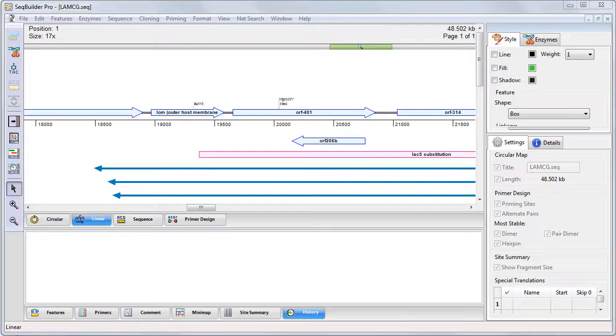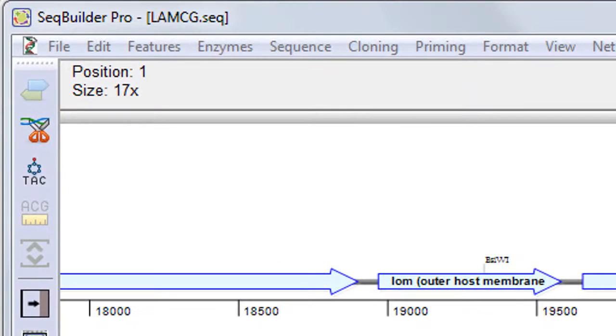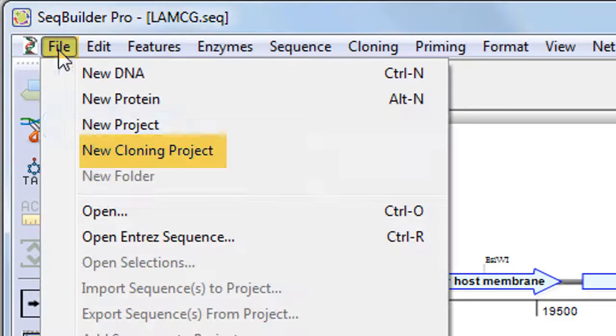To create a virtual clone, start by launching SeqBuilder Pro. Then create a new cloning project using the File New Cloning Project command.